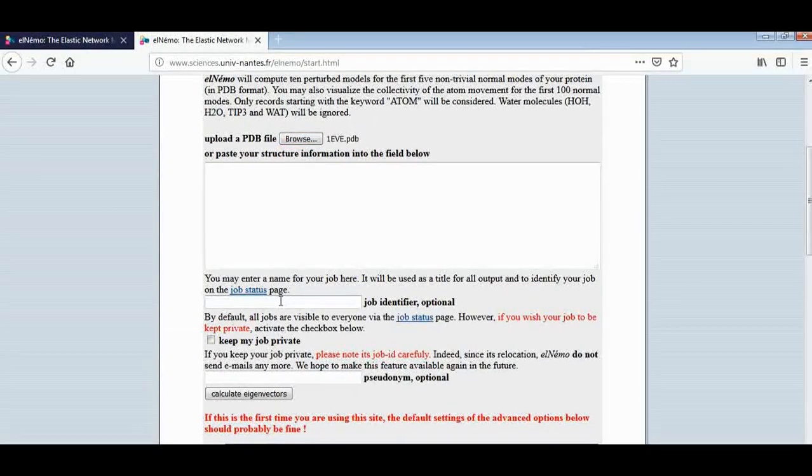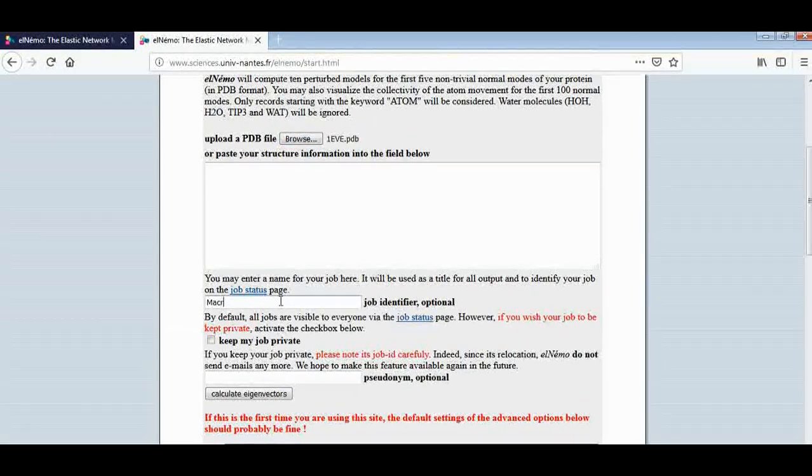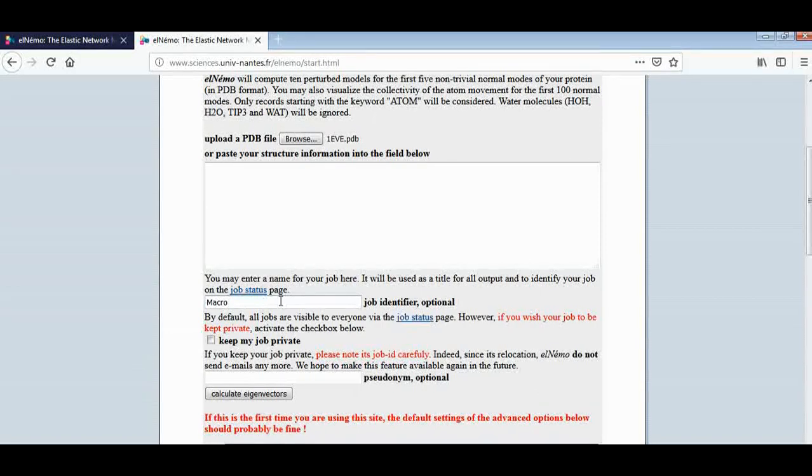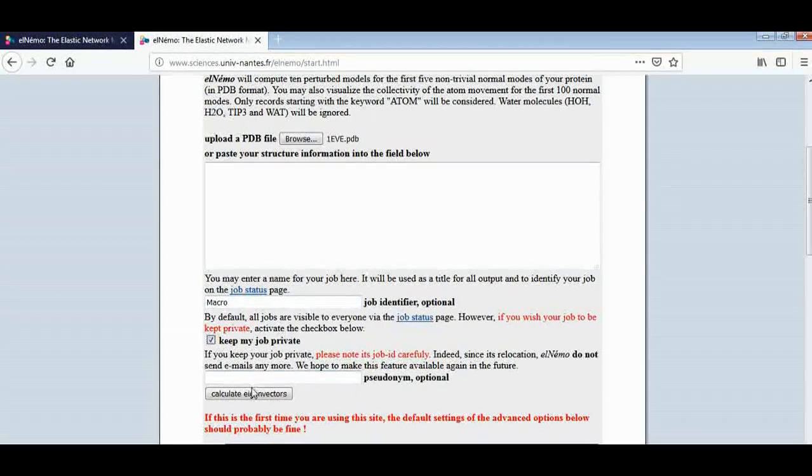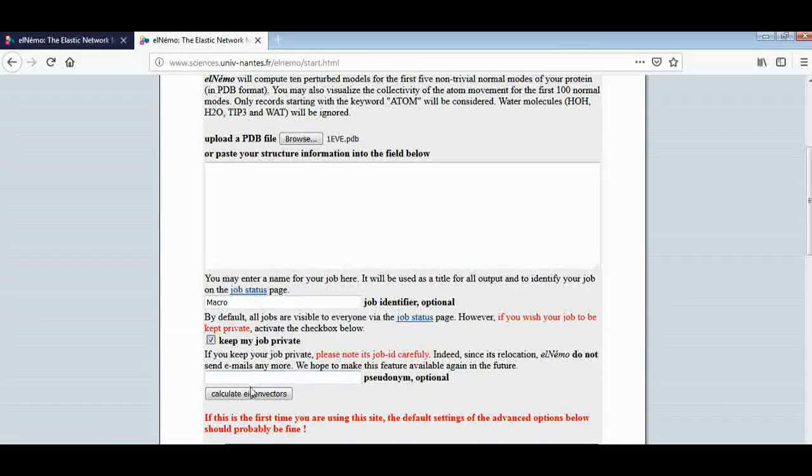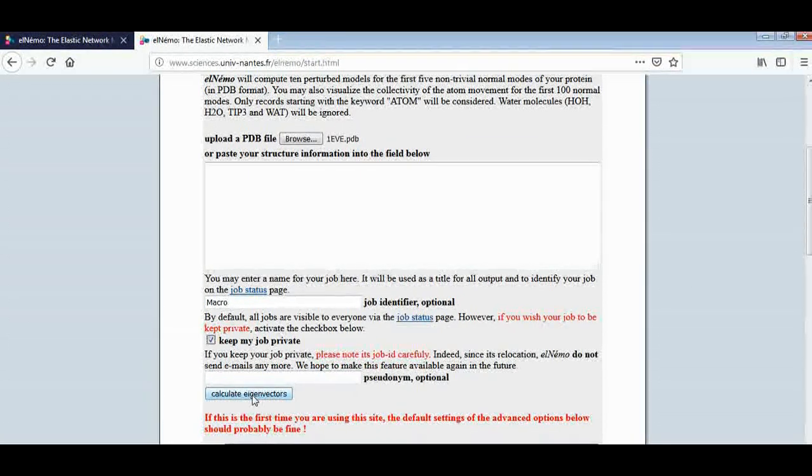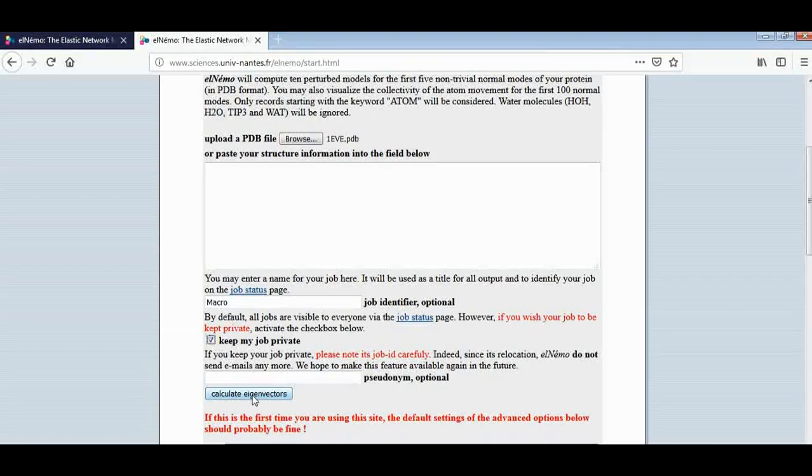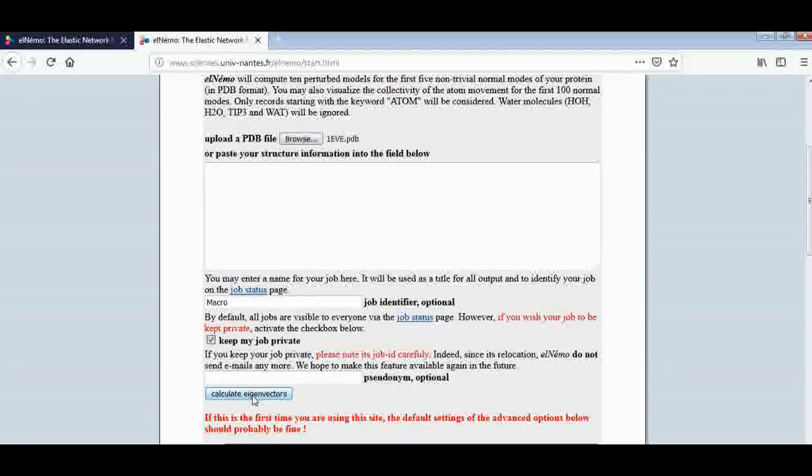Keep my job private. And here I would like to give the command that calculates eigenvectors. This option is used to compare the two conformations.